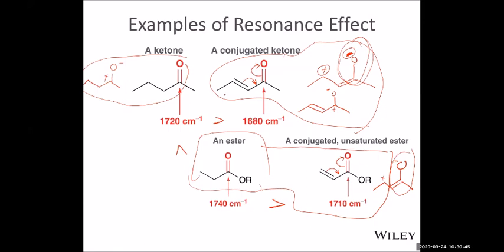So a property like this helps organic chemists identify which is which. Especially when we have 2 compounds and we know the compounds are these 2, and you want to tell which is which, you often use infrared. This is much better than using other physical properties such as the boiling point, solubility, or reactivity. Those need a significant amount of chemicals, whereas with infrared, you just take milligrams, for example. You can just identify these 2 compounds, which is which.